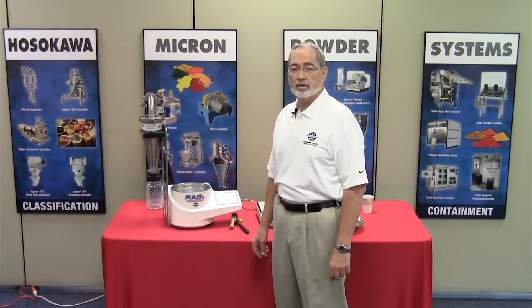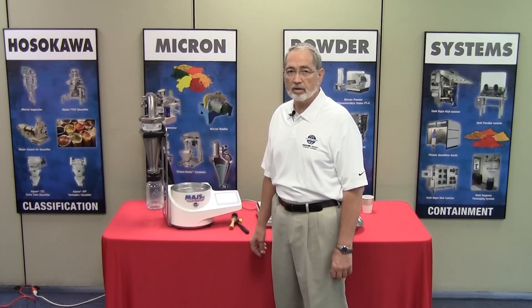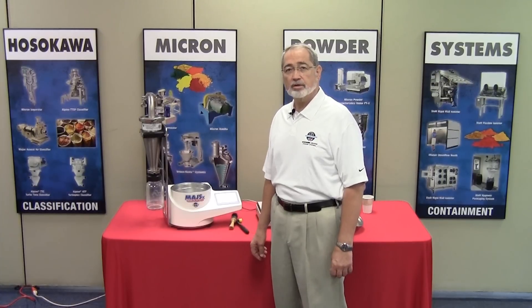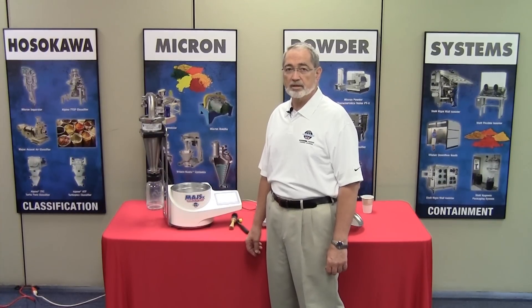Hi, my name is Tim Calvo and I'm with the Laboratory Equipment Sales Group of Hosokawa Micron Powder Systems. Today we're here to introduce the Hosokawa Micro Airjet Sieve for particle size analysis.